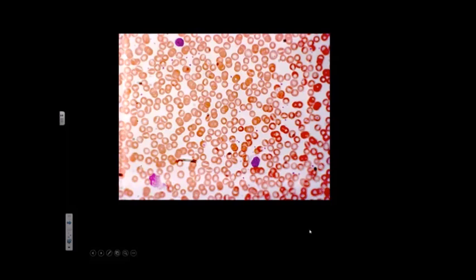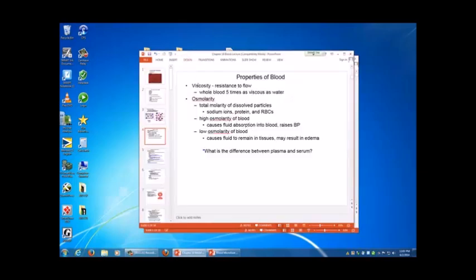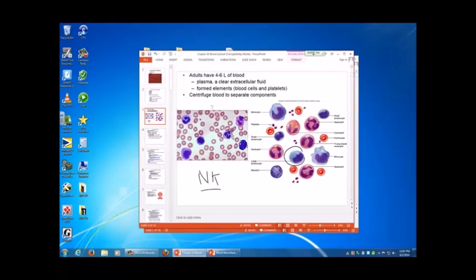And keep in mind that when you're looking at these images, this one right here in particular, it is extremely rare that you're going to see all the cell types in one image like that. Whoever found that slide was probably looking at not hundreds, probably thousands of blood cells. Okay? To find that one, that person was really, really lucky.